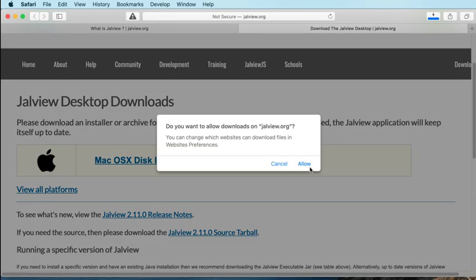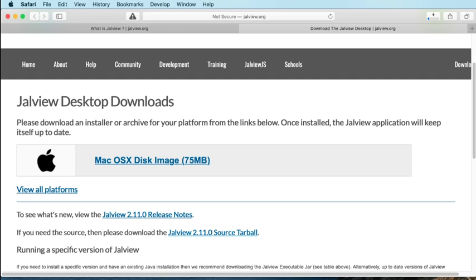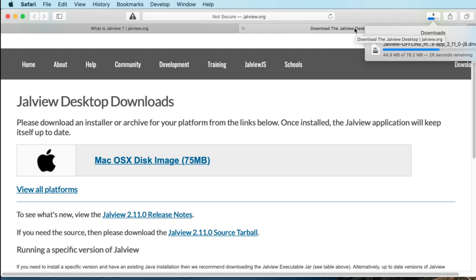So I'm going to download it and install it. Improvising slightly. That'll take a little while because it's quite big. It's going to take a minute or so to download. And then once that's downloaded, I can run that installer and get things running locally, like a standard software install, rather than necessarily relying on conda to do this for me. There are other ways and means of getting this running.